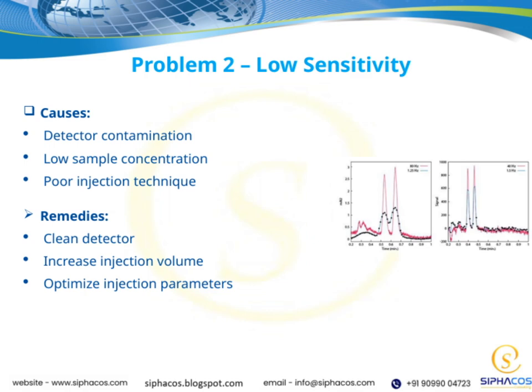To address these issues, we can start by cleaning the detector thoroughly to remove any contaminants that might be affecting its performance.